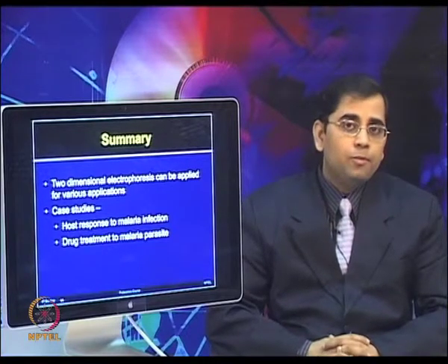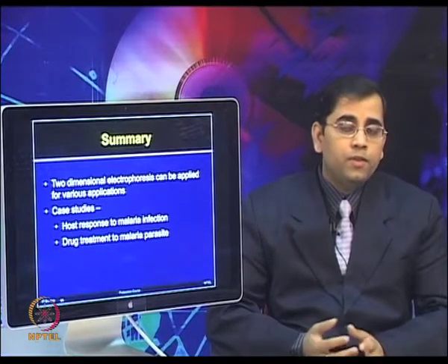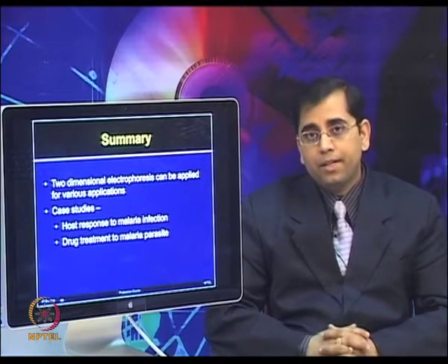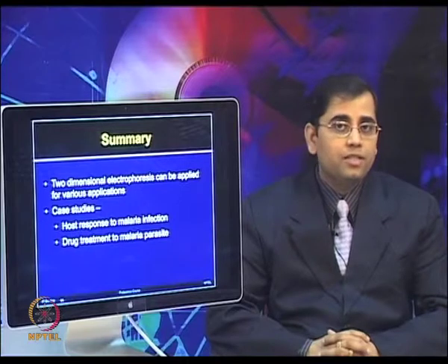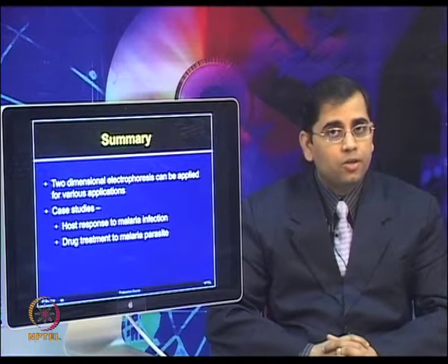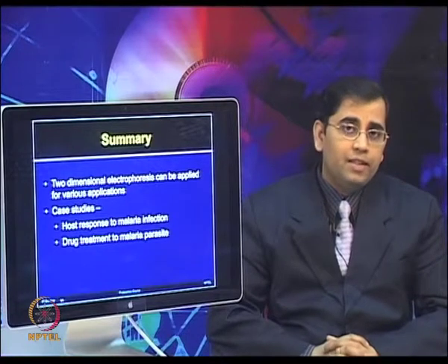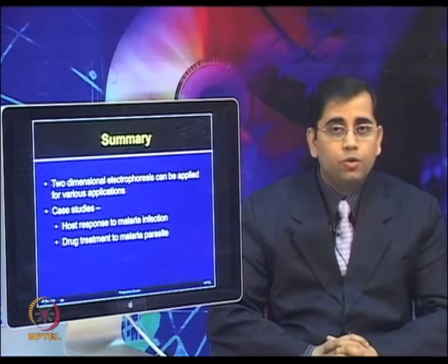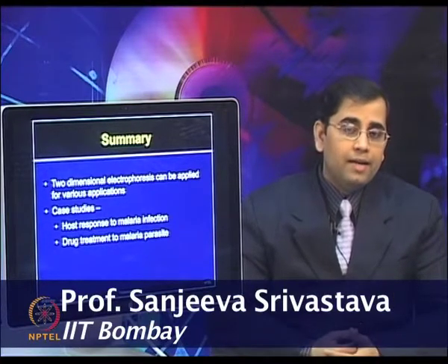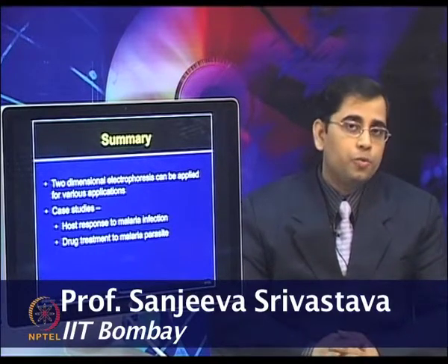So, not only today we discussed one application, how host serum protein changes due to one of the Plasmodium parasites, but also we discussed the various nitty-gritty experiments one needs to perform to achieve this type of comparison. We will continue our discussion on some more applications of two-dimensional electrophoresis and also two-dimensional difference gel electrophoresis, because due to the variations in the 2DE, people also try 2D DIGE experiments, and that is very sensitive. So, that also expands the overall proteome coverage.